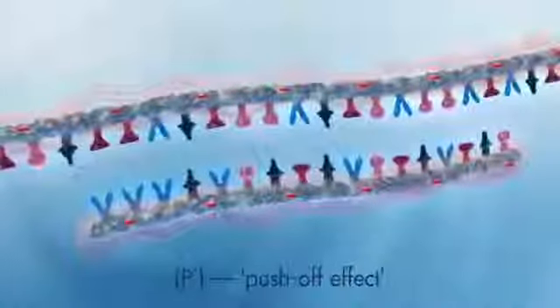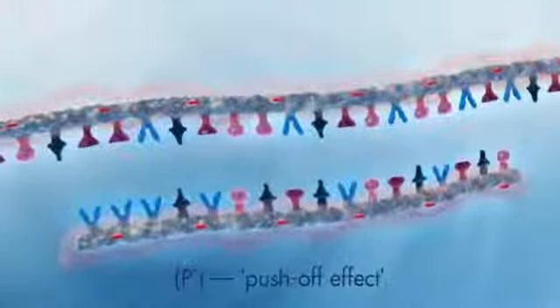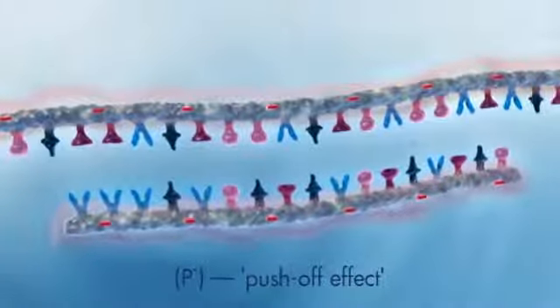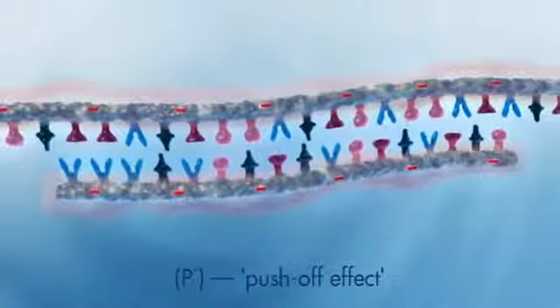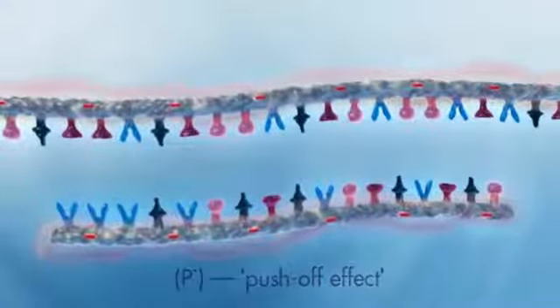How does DNA behave in solution without the influence of ions? The DNA template and primer molecule, indicated here with a minus sign, are negatively charged and therefore show less tendency to anneal to each other due to electrorepulsive forces. A push-off effect between the DNA template and primer molecule is the result.